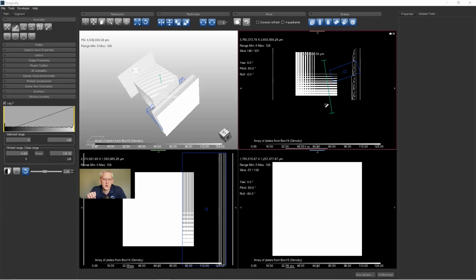The last question I'll take is regarding image stack alignments. I've got a FIBSEM serial section that I can share. Does it need to be in a specific format? TIFF would be great, David. If you have a FIBSEM stack of TIFF format, I can use it to demonstrate the alignment tools and I can share it with other people, that'd be great.